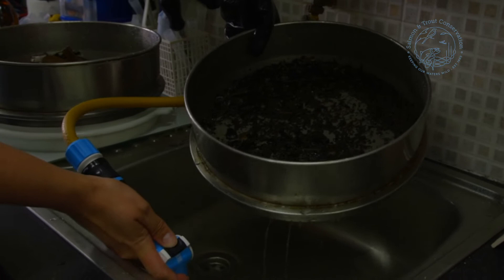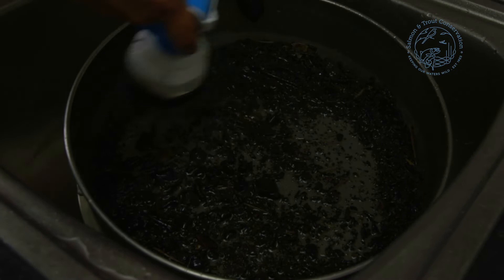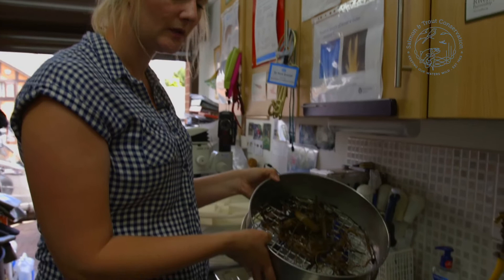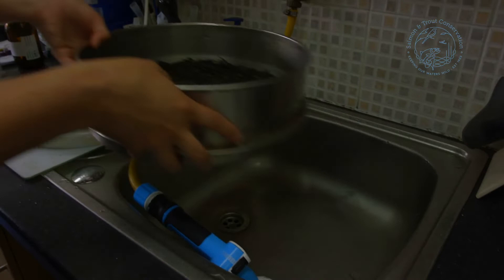I'm just going to let the sink clear and give it one more run through. Now I'm happy that the water is running quite clearly through there. Now that the sample is all nice and clean, I'm going to take the matter that we took out initially and pop it onto a spare tray. I can see I haven't lost any animals in the tray, and I'm just going to pop it in here and then we can take it through to our large tray ready to sort it.